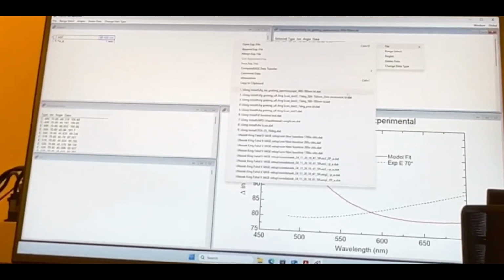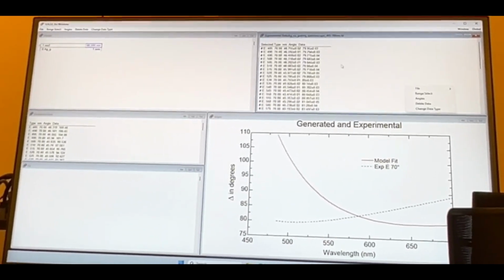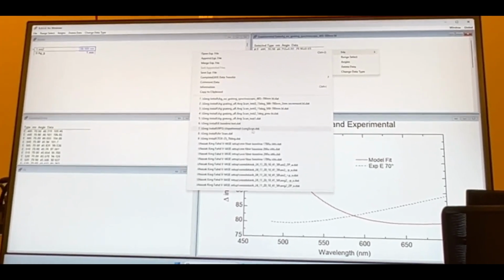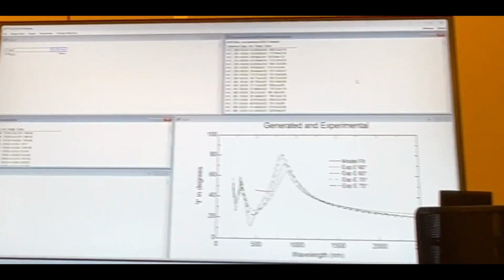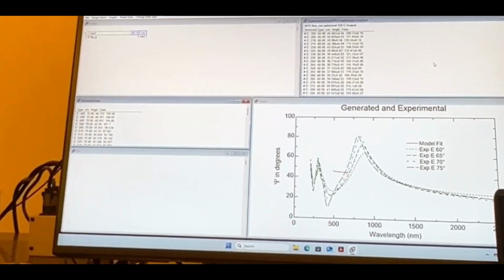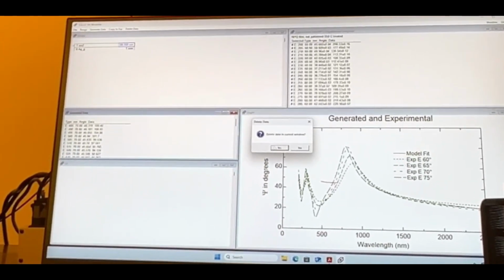Okay. So we can look down here, and this is probably it right here. It's a little bit of a shortcut if you want to go find it. If it was not that long ago, I assume it's this one. Yep. So here's that data. We let it run overnight. We had the auto retarder on. We did a lot of other stuff. I'm going to clear this off for a second. I haven't tried to fit it yet. I saw it was here this morning.